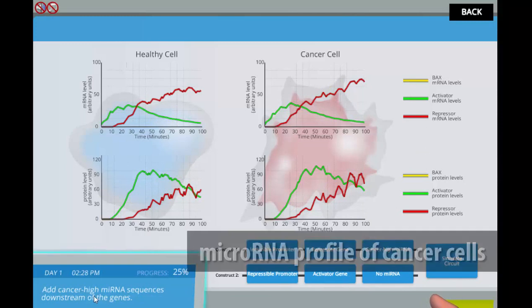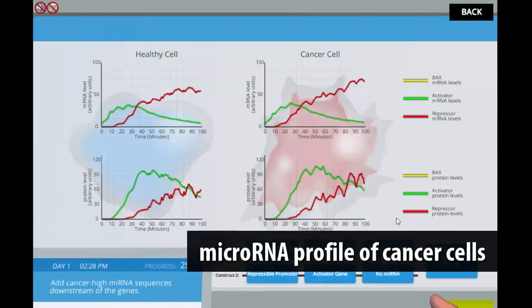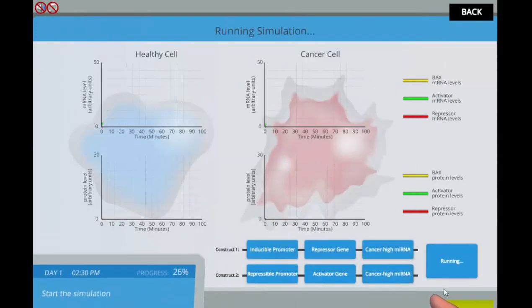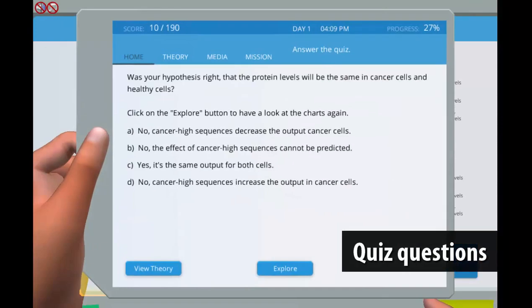They will use the specific microRNA profile of cancer cells to design an apoptotic biological circuit that will selectively kill cancer cells. Quiz questions will be asked throughout the experimental processes.